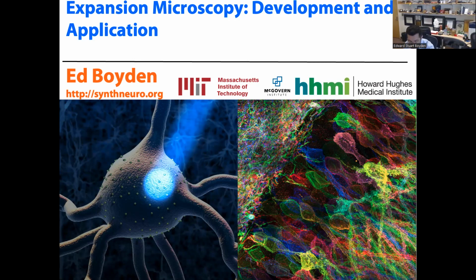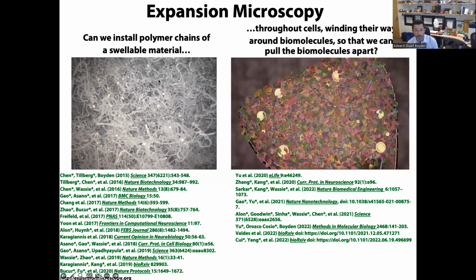More recently, we've been focusing on imaging of biological systems. Today I'll focus on one of those tool sets, expansion microscopy, that's also been spreading very rapidly throughout biology, both basic and applied. The basic idea is, in contrast to the last several hundred years of microscopy, where imaging relies on magnifying an image with a lens, we're trying to magnify objects directly.